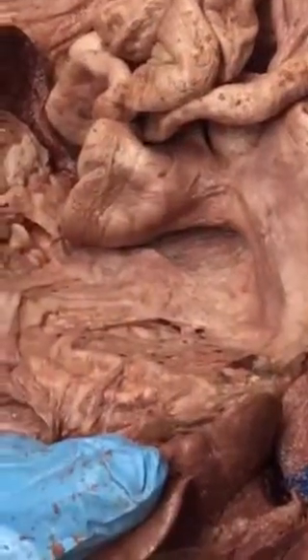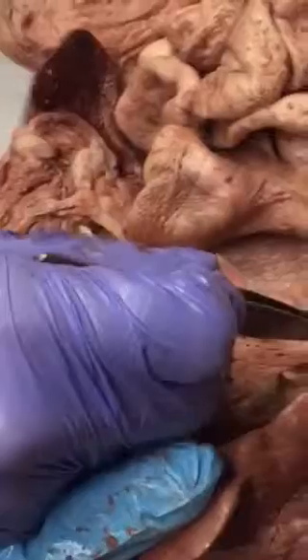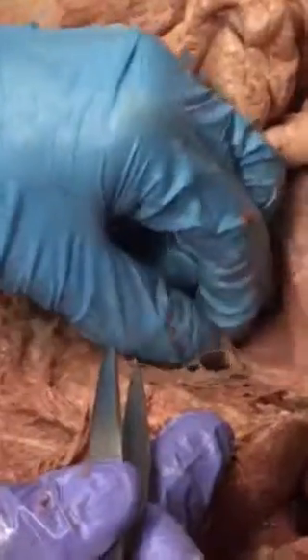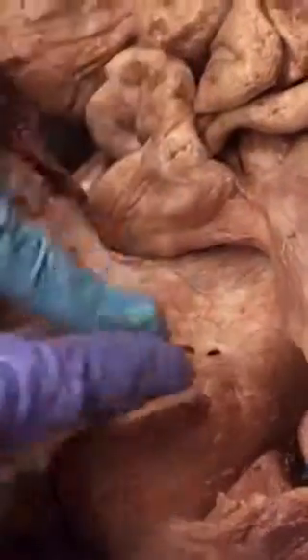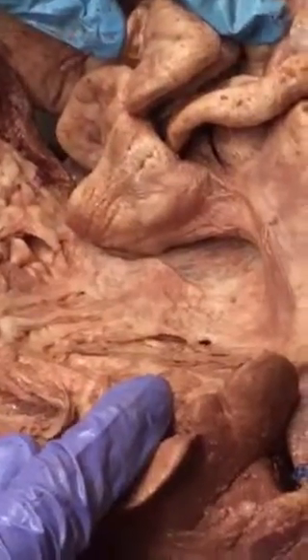There are two leaves to the pancreas. One of them goes underneath the stomach, and the other one is right there in the curve of the duodenum. When you go to look for it, it doesn't feel like much of anything. It looks kind of like fat. So it helps to have a paper towel to clean it up a little bit, and you can see that chunky, meaty look to it.